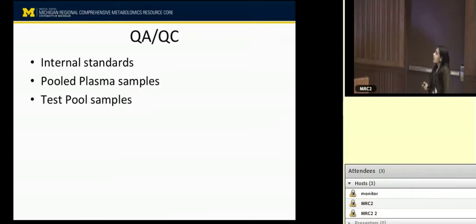So this is just to show how LipidBlast does the identification in terms of spectra. Below, you can see the LipidBlast spectra, and on the top we have the spectra from our experimental data set. And as was explained, this is one of our standards that we spike in, PC 34:0. One characteristic fragment for choline is this peak 184, and it is obvious that this is going to be the highest peak. So this matches right here, and there are a couple of other peaks that match here.